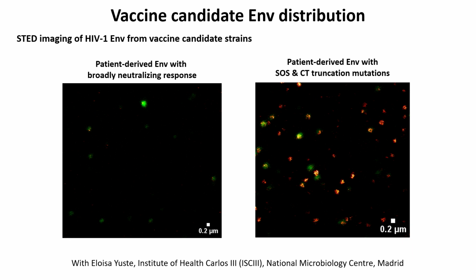Whereas right now with a modern STED microscope, and I can imagine probably with the other techniques as well, it took me really 30 seconds. With a click of the button of the auto-align microscope, bam, I have the images. So right now the technology is so much more mature and so much easier. You don't have to worry about alignments. You don't have to worry about all the problems that we had with the early microscopes. You can just get to the data.